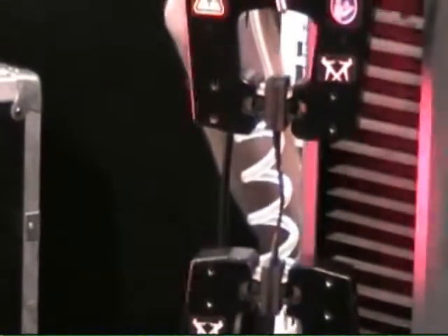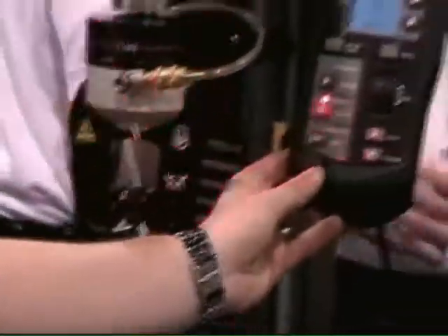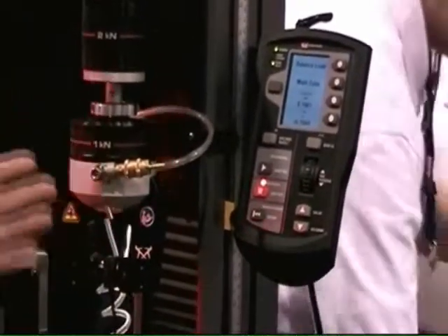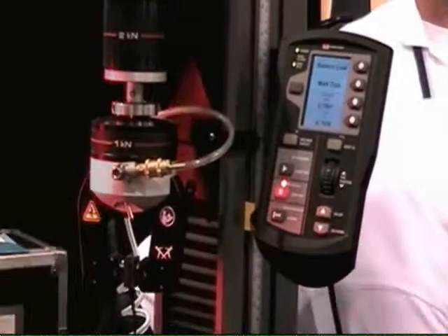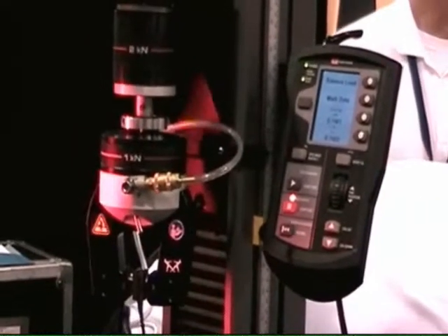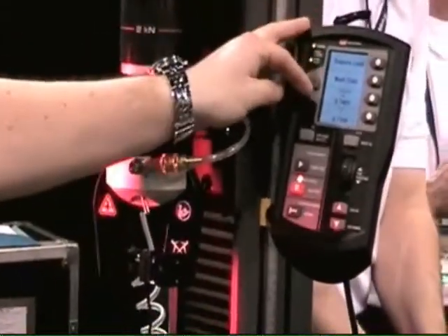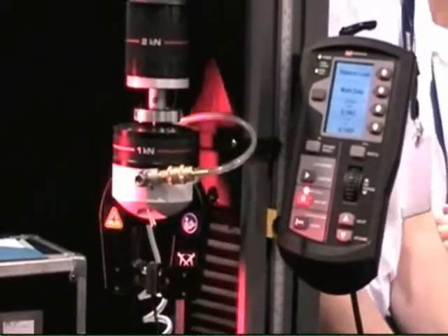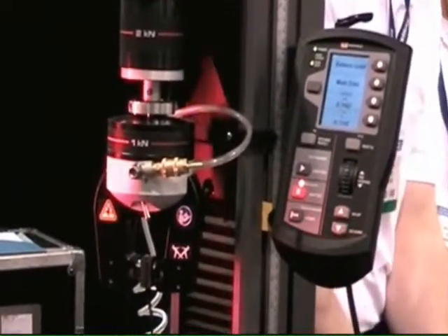Another nice usability feature of the 5900 is this handset. The operator can program the method in the test in the software, and then come to the machine, run all their testing, and not have to go back between the frame and the software. You have some live displays, soft keys that can be programmed, and in the future we hope to have results and other information available.